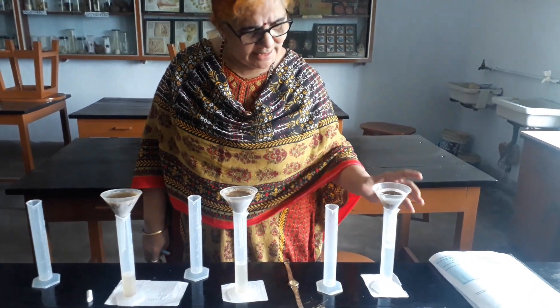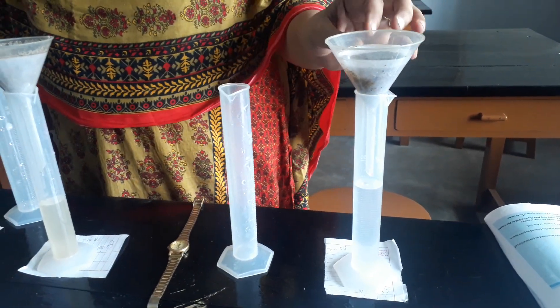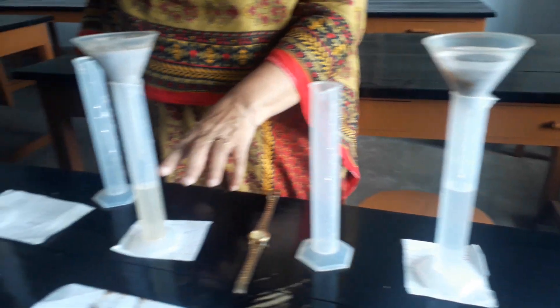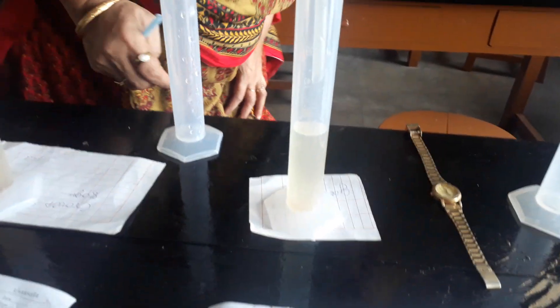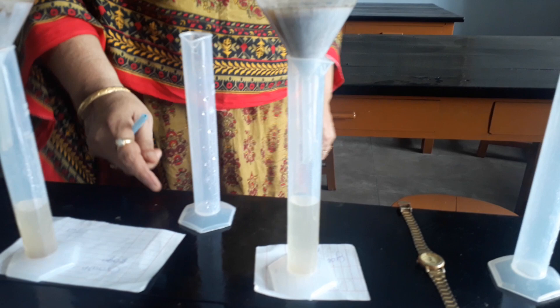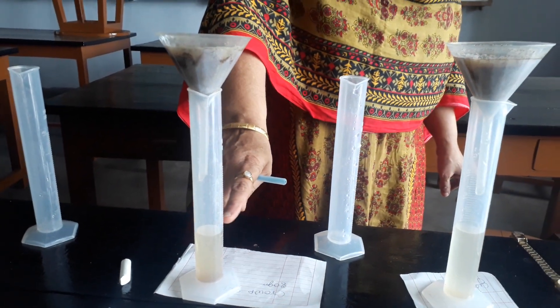If you observe, the sand is falling very fast — already it came to 40 ml. Almost maximum water is falling through sand. Here silt is just reaching 30 ml. And clay is just reaching 23 to 24 ml, around 23. So sand drains fastest, silt is moderate, and clay retains the most water.